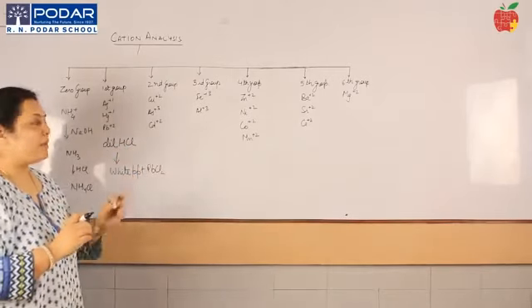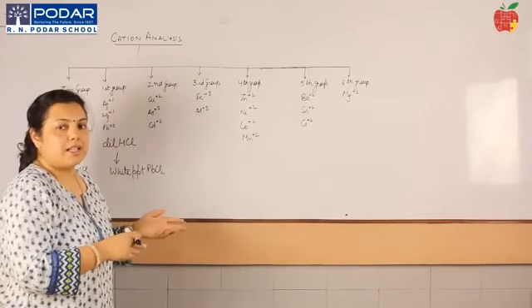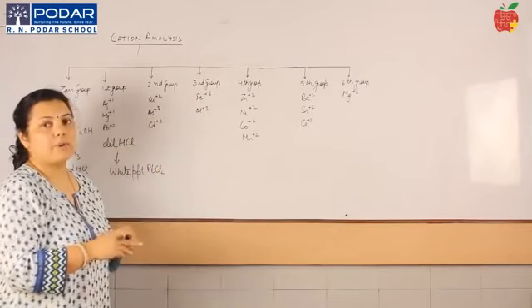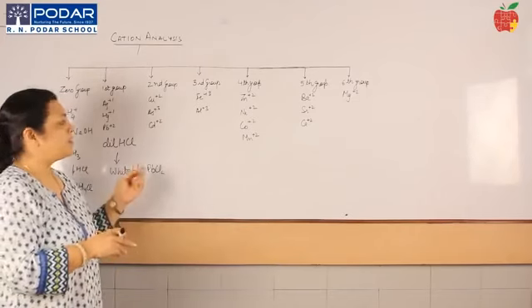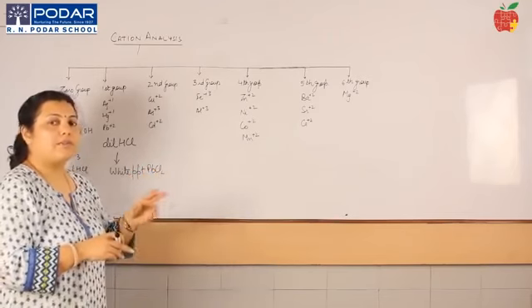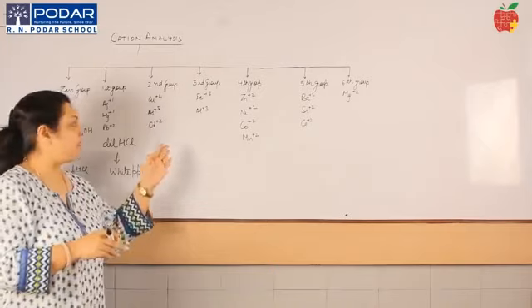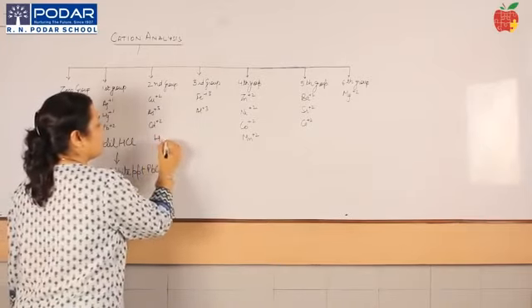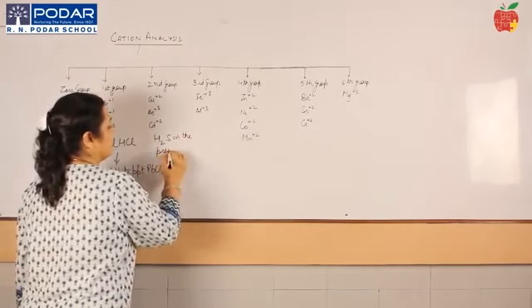Moving on to the second group. In the second group, you have copper, arsenic and cadmium. Arsenic is a little poisonous and cadmium is costly, so again we only concentrate on the copper ions. As already discussed, copper ions are blue in color. So the color itself will give you an idea whether you have the copper salt or not. But from the color, we still need to do a preliminary test to identify the cation. The group reagent for this is H2S in the presence of HCl.